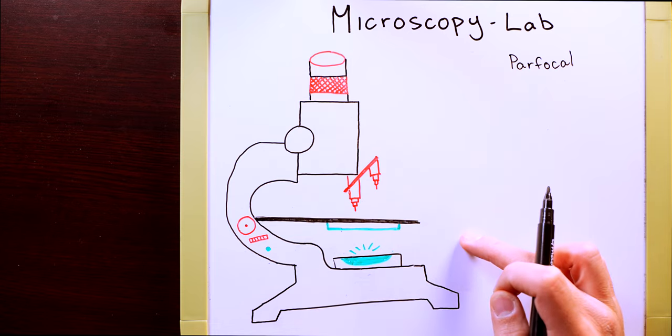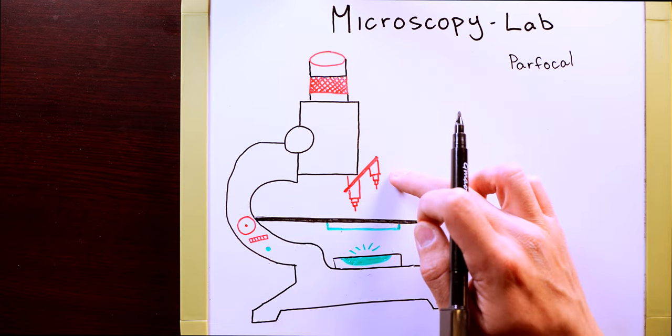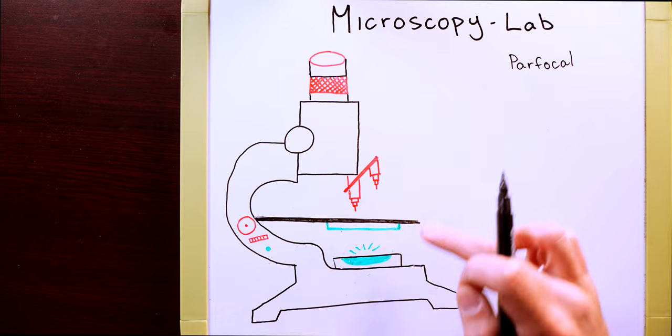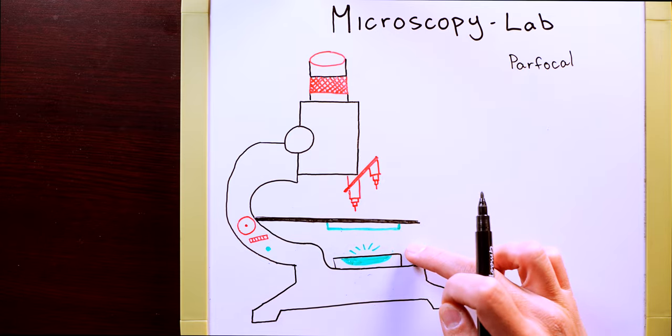Here you can see that our microscope is color-coordinated. The objects in red are going to control your magnification, while the objects in green are going to control your light adjustment.